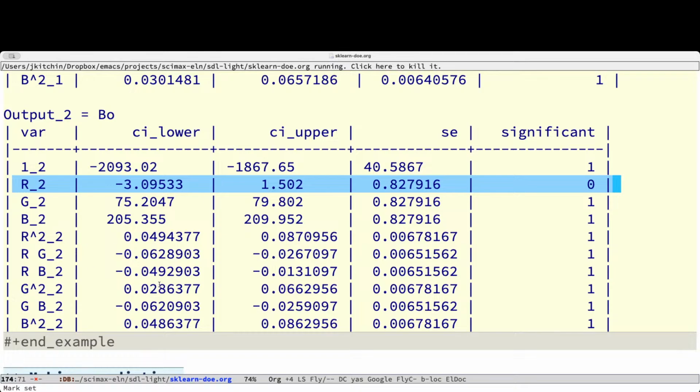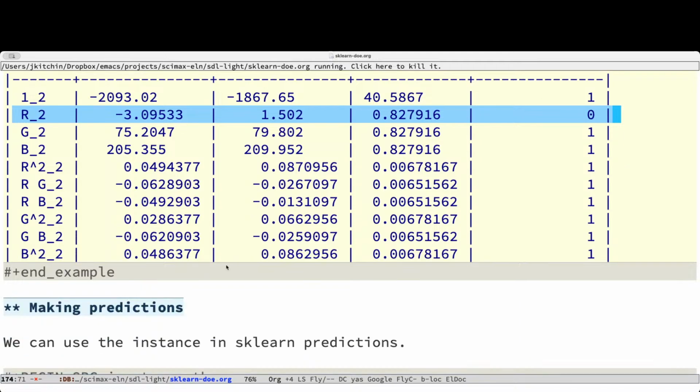And here I'm taking a more heuristic view that if the confidence interval includes 0, then there's a reasonable chance that it is 0 and that it's not relevant. That's true for this linear model. Certainly there's room for more significant analysis in here than I'm doing.